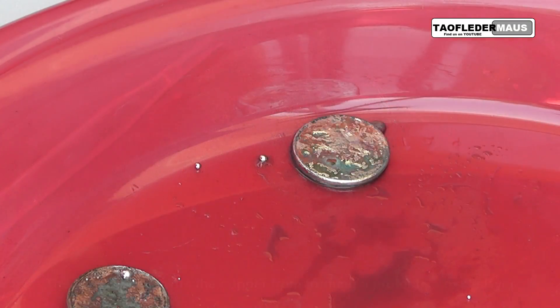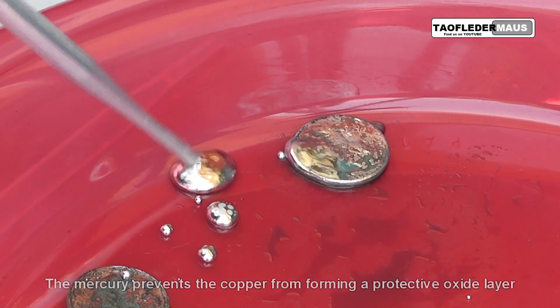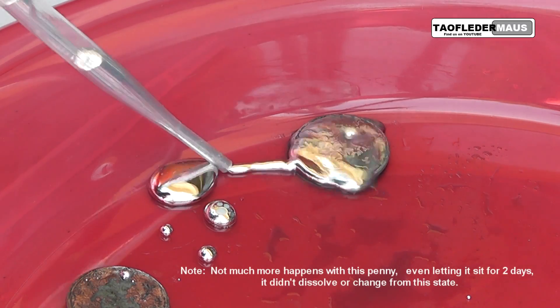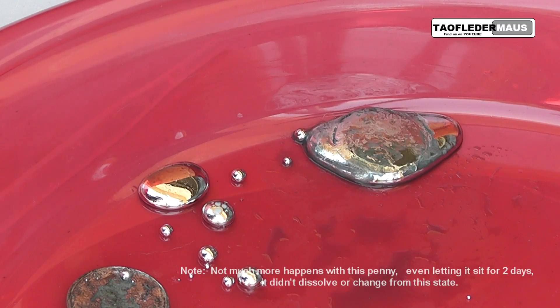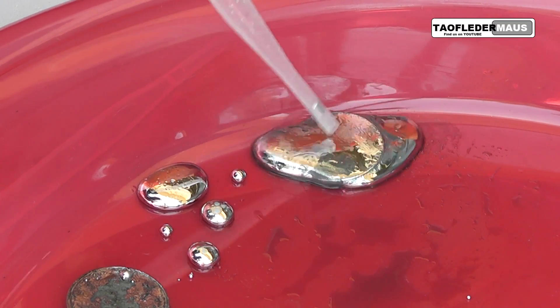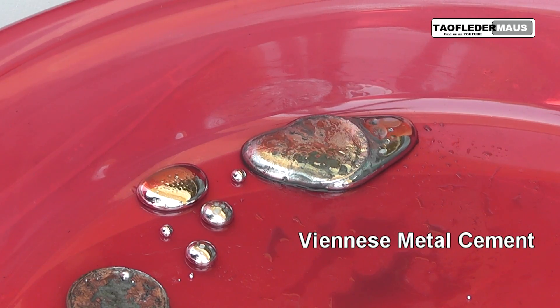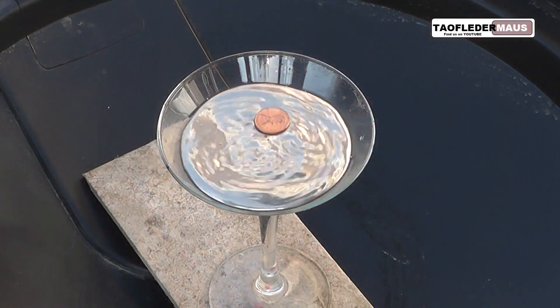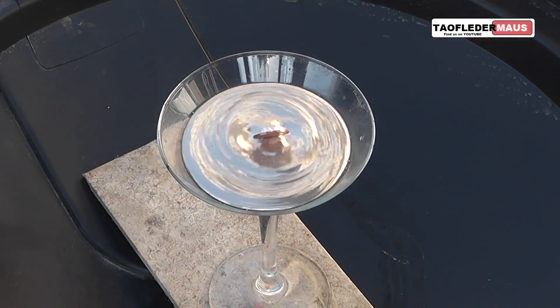Now that this penny is tinned with mercury, you can see how well it just attracts more mercury to it. A hundred years ago before they had epoxies, they would combine powdered copper with mercury and came up with this stuff called Viennese metal cement. They would use it to fill teeth, make imitation gold jewelry, or even mend porcelain and ceramics.